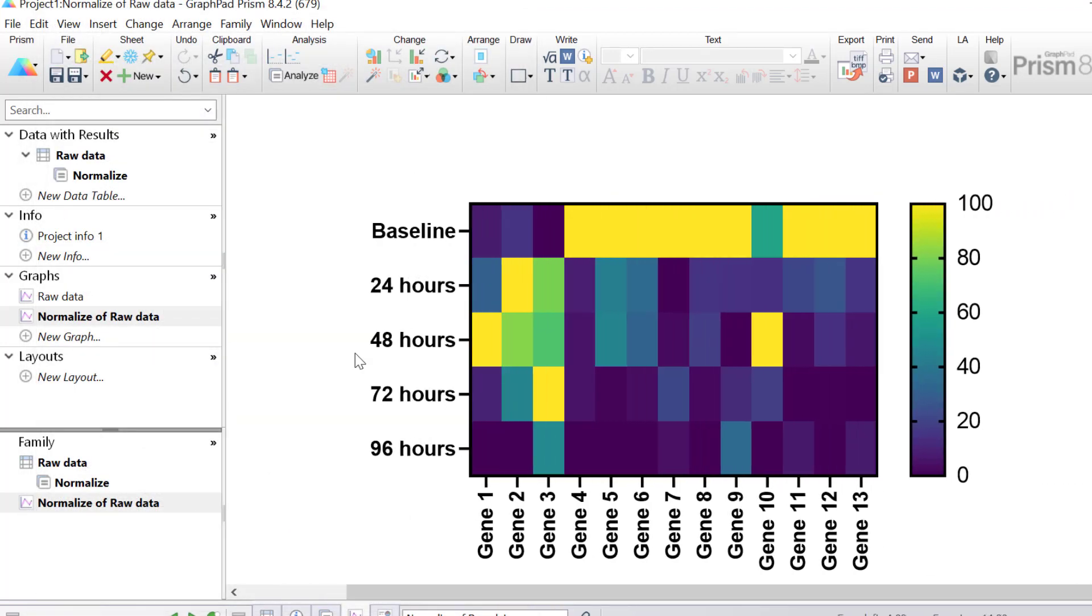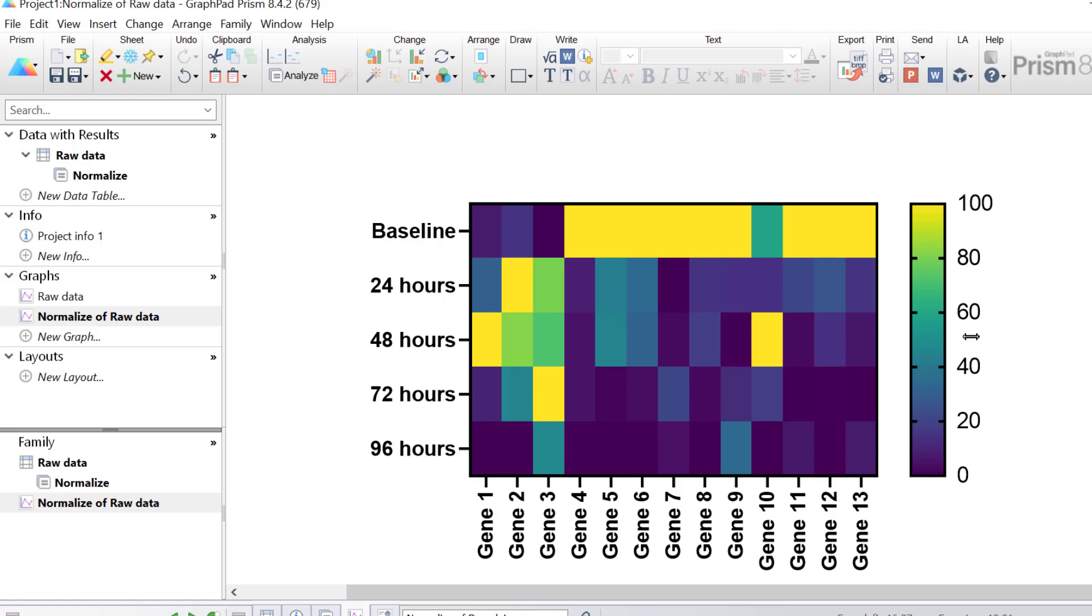So let's look at this heatmap in more detail. Now at the top of the scale, yellow indicates a normalised gene expression value of 100%. At the other end of the scale, dark blue indicates a normalised gene expression value of 0%, and the colour in the middle, which is a turquoise colour, indicates a normalised gene expression value of 50%.